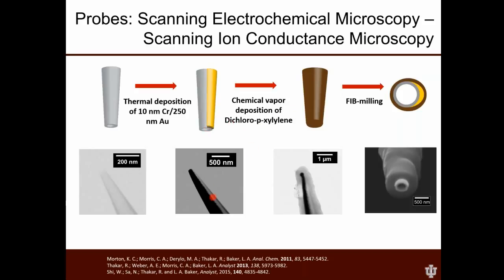That's shown here in this electron micrograph, you can see the gold layer. This is a STEM image again, so we're trying to shoot through it. We can't go through the gold layer, so the gold layer is here on the outside, and the quartz is here on this side. The electron beam's going through it.